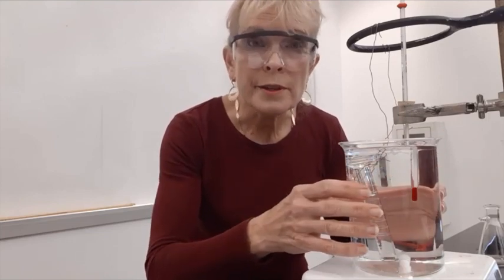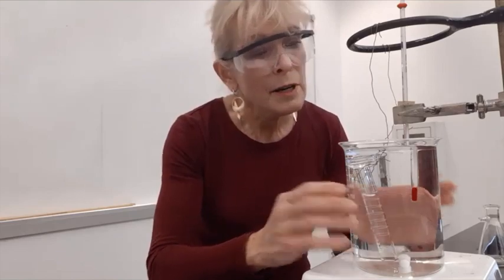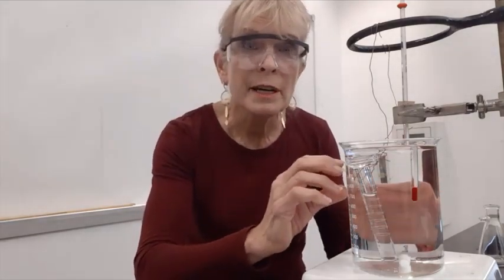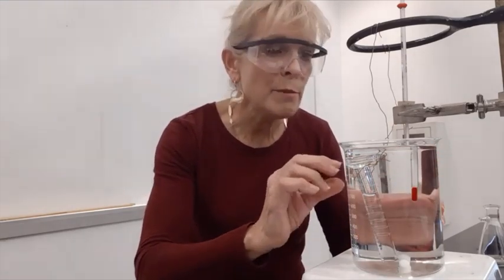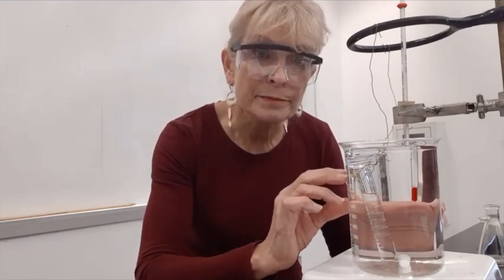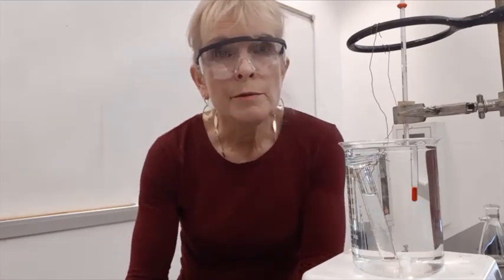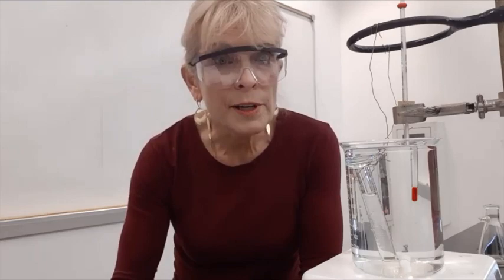At 0 Celsius, the vapor pressure of water is pretty close to 0, so whatever volume the bubble has at 0 C will enable us to figure out how many moles of air we had in this bubble. Okay, that's the end of the experimental description.